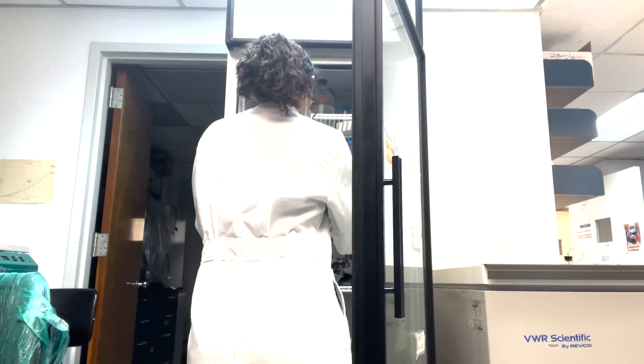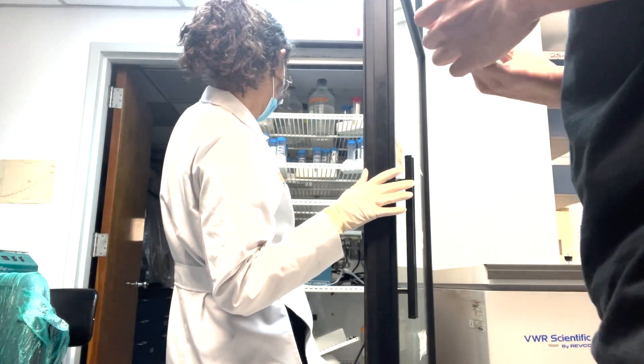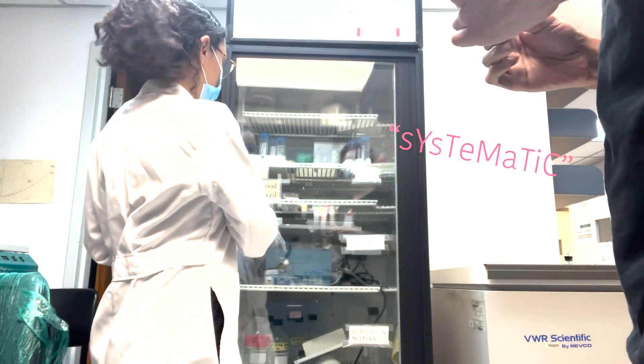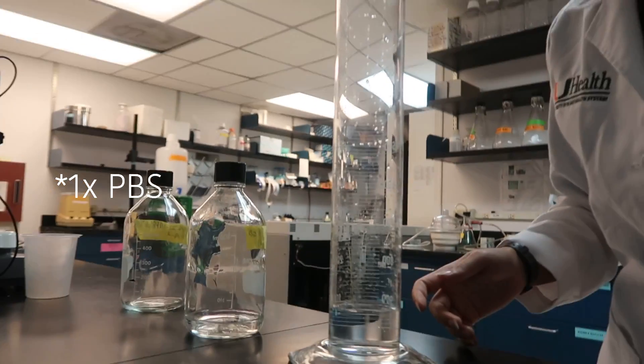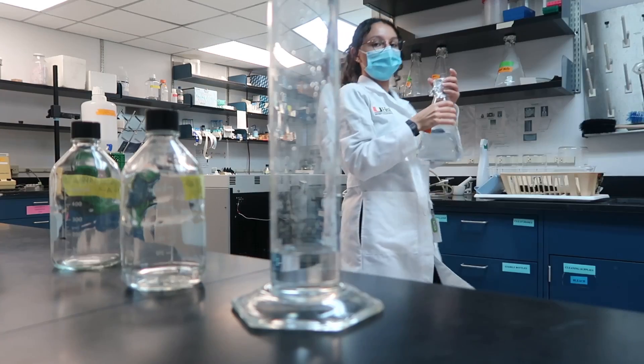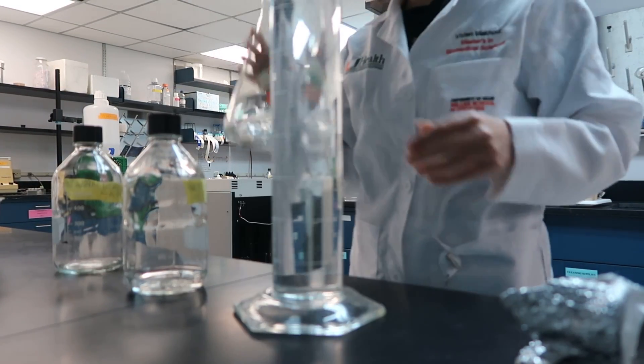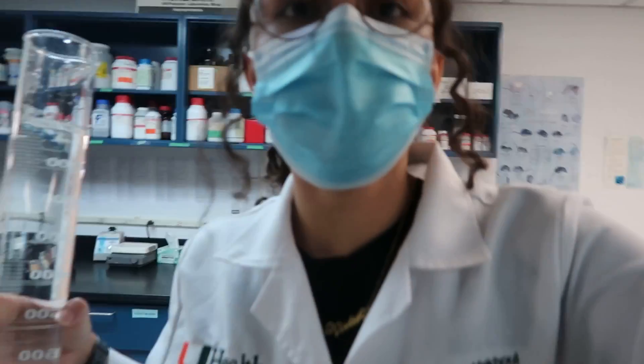You're making a video for history or what? I'm vlogging. Do you have many followers? No, I'm vlogging — I'm looking for the shadow with the doctor. Thank you, and being systematic. It's all appearances. Okay, I'm making PBS. So I added my PBS, now I'm going to add DI. And now I just pour it into the bottle.